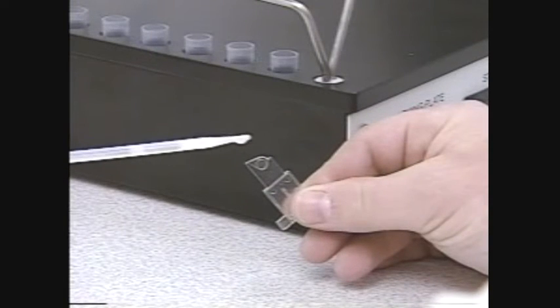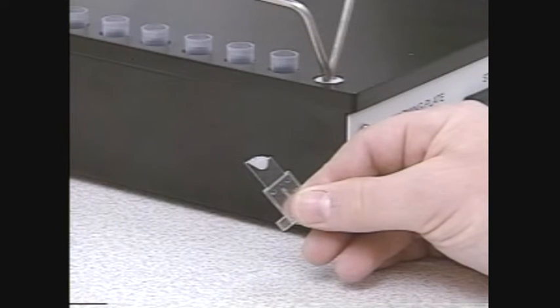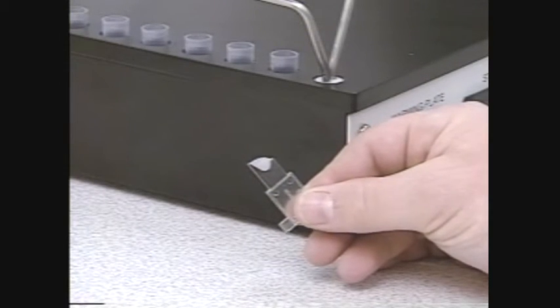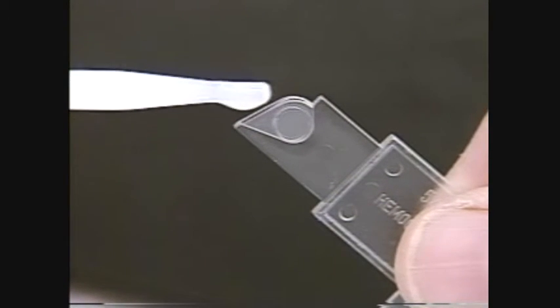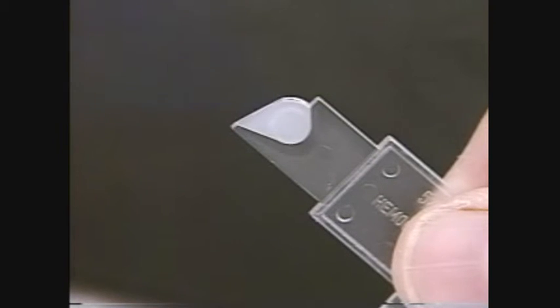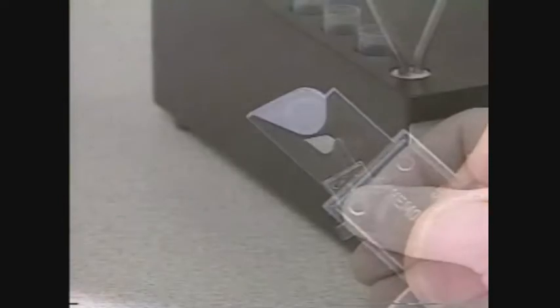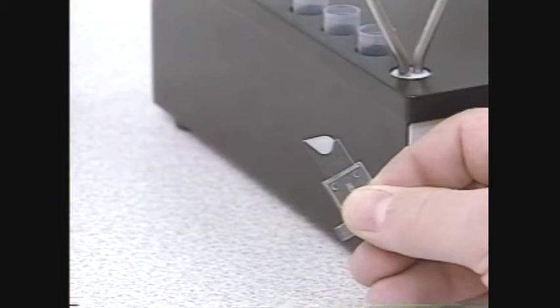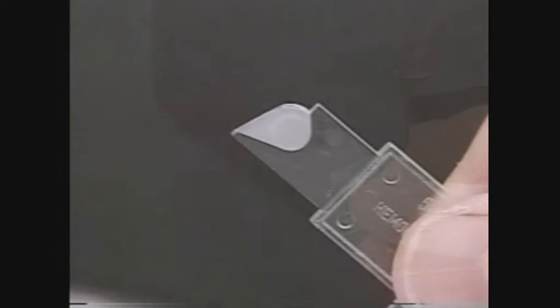The raw ejaculate should be mixed gently but thoroughly to ensure that a representative sample is obtained. With a pipette, a sample of semen is removed from the ejaculate and the cuvette loaded by placing a drop in the open end. This requires less than 0.5 milliliter of semen. Then the cuvette is wiped on both sides with a lint-free tissue, taking special care not to touch the open end. The cuvette should be checked to ensure proper filling without any air bubbles.